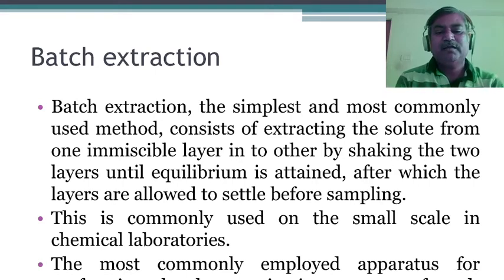Initially, we take a separatory funnel. Both solvents are added, the solute is added, and shaking is given. After the extraction, we let it stand for some time, and then separation is carried out. This is a single batch. So batch extraction is the simplest and most commonly used method.